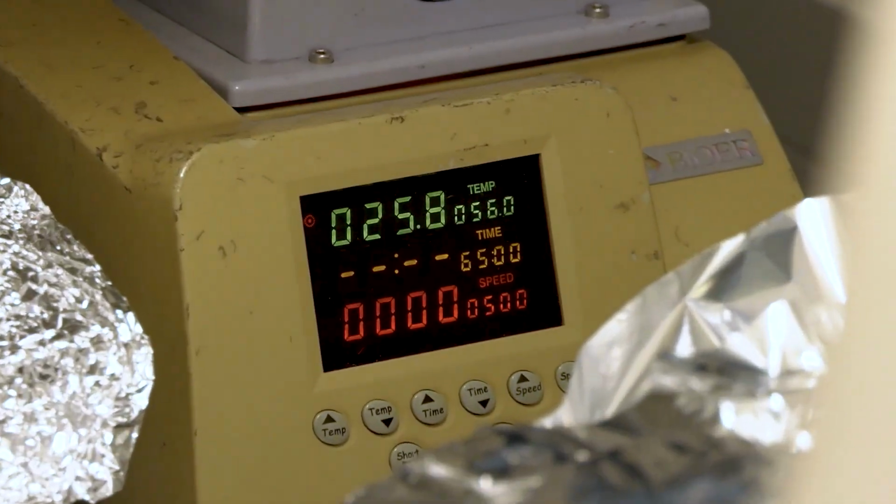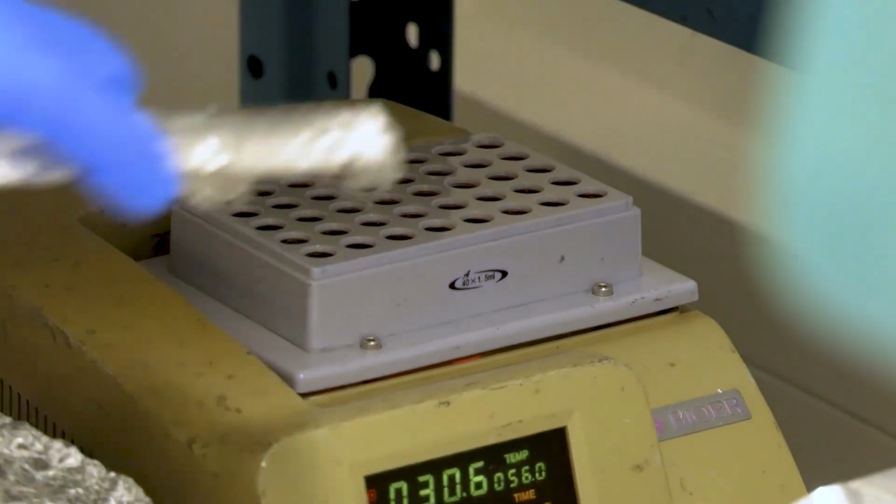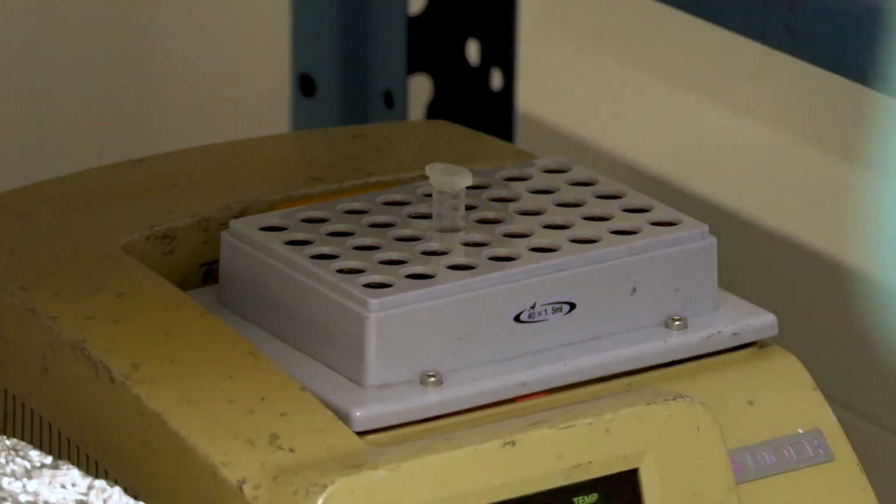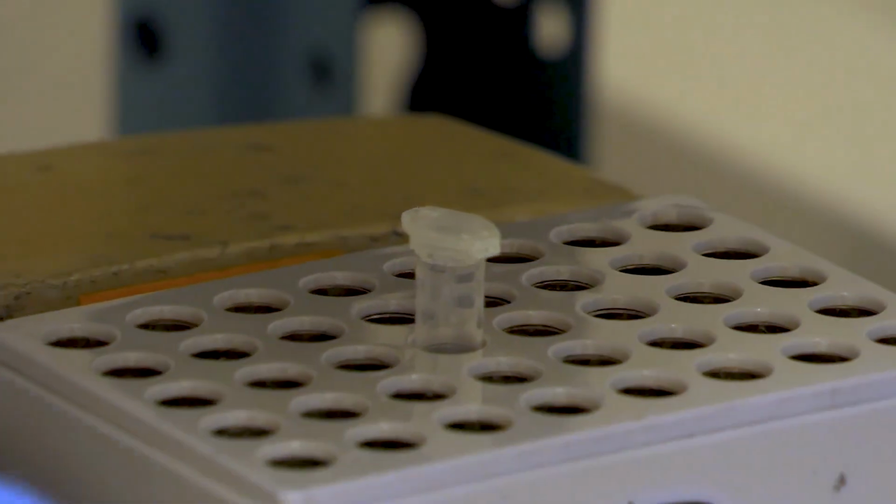In the non-destructive approach, in which the samples should be kept intact after lysis, nevertheless make sure to use enough lysis buffer to keep the leg from breaking.